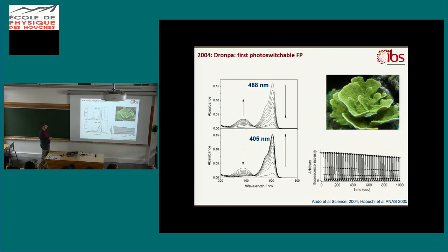Again, it's a one-to-one conversion, but between the anionic and a protonated state of the chromophore, so the tyrosine that Dominic showed you the first day. The tyrosine of the chromophore is protonated at the end, it's the opposite. When you shine with 488 nanometers, the anionic form is depleted to the protonated state of the chromophore. But the news is that it's totally reversible, modulo the bleaching, of course, to the initial state. So it's a real switcher. You switch on and off the light, and that's made many, many times here, with these shark fin experiments.